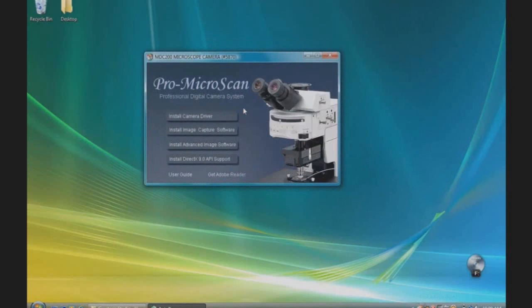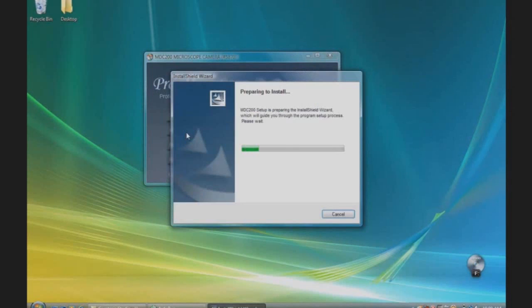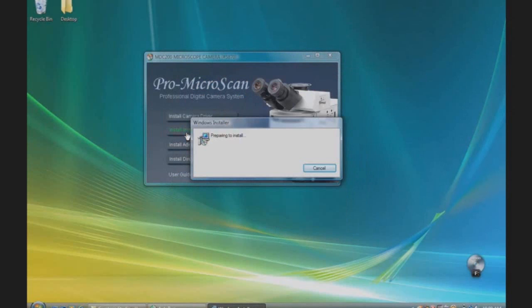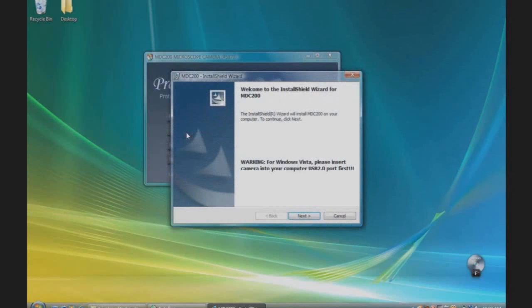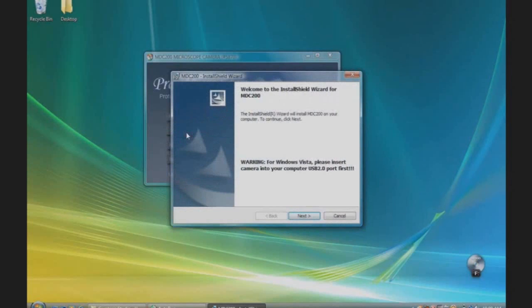First, we will install the camera driver. Select Install Camera Driver. The installation wizard will appear. For Windows Vista users, please insert the camera into the USB port first. Follow the installation instructions.